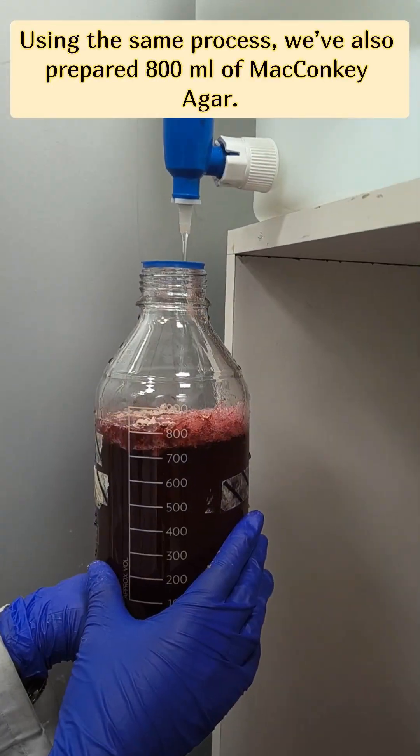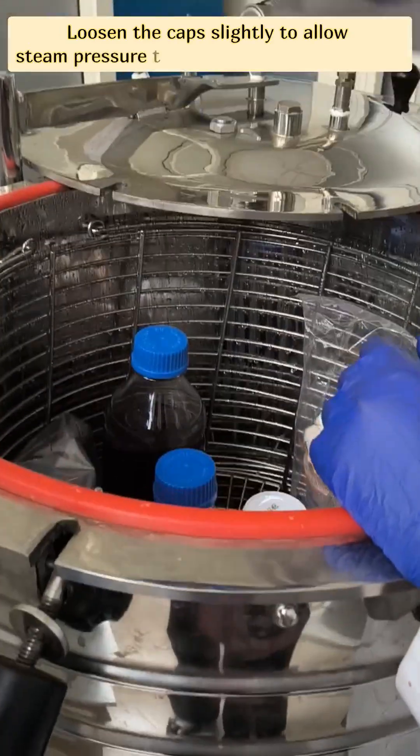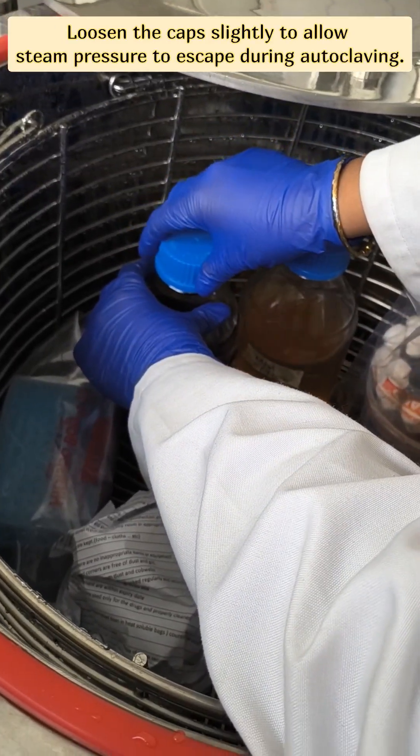Using the same process, we have also prepared 800 ml of MacConkey agar. Loosen the caps lightly — this allows the pressure to escape during autoclaving.